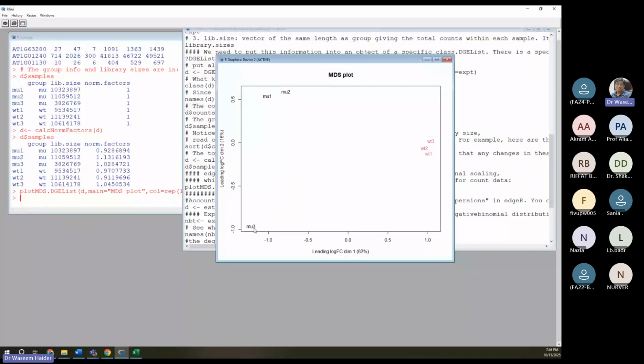Either if I had more samples, like 5 here or 5 here, I would have removed that. Why am I not removing it? Because I already lack replicates. So when I do this statistical testing, if I throw away the replicates, I will lose statistical power, the power to reject the null hypothesis, which is wrong. That's not the topic of this discussion, but that is one very important thing. You should pay attention when she comes to type 1 errors, type 2 errors, or power.